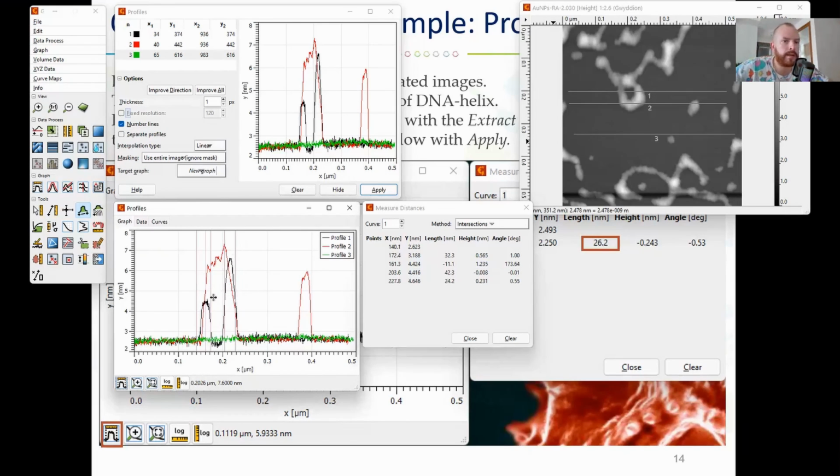Why am I selecting the half height of the sample? Simply because this part is already less in the real world. Again, this will be the topic of the next lecture, because your cantilever, the tip of the cantilever, has physical dimensions.